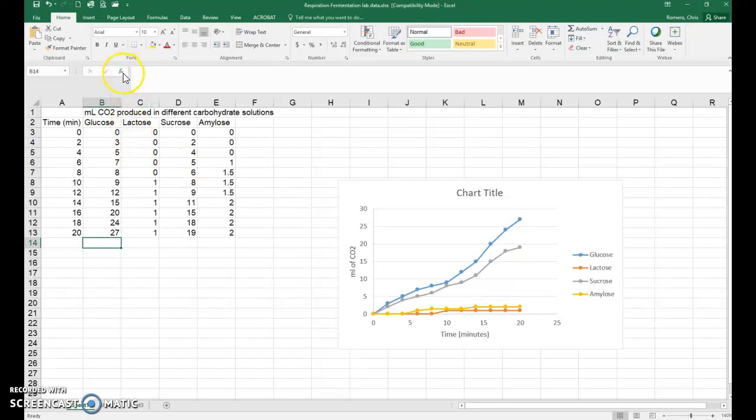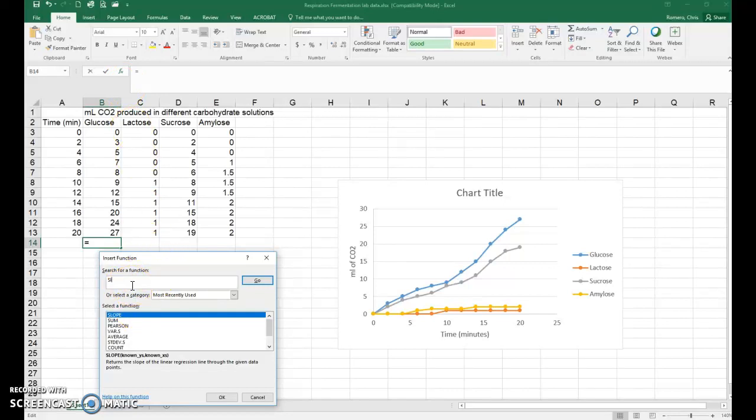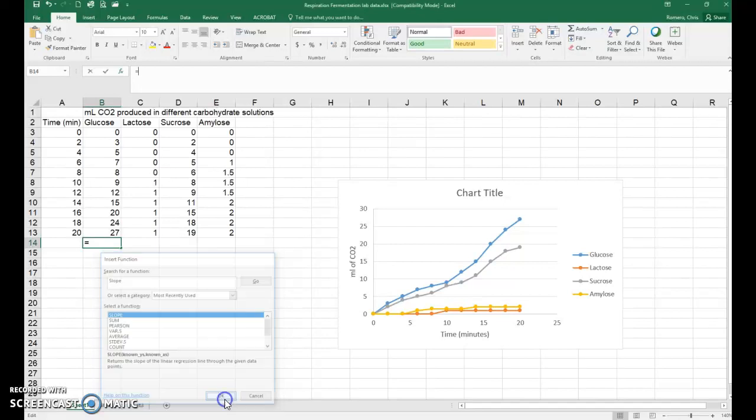So you go up to the Insert Function button and just click on that. And it's going to ask you to search for a function. You can just type in slope there because that's what we're calculating. Or if it's already available because you've used it before, just double-click on that and it'll open that function up.